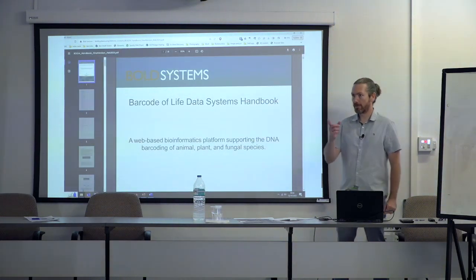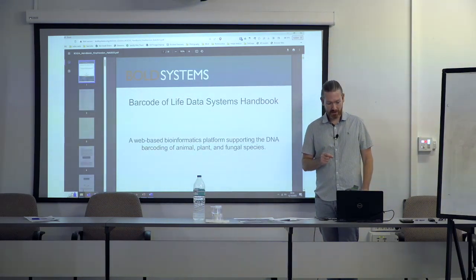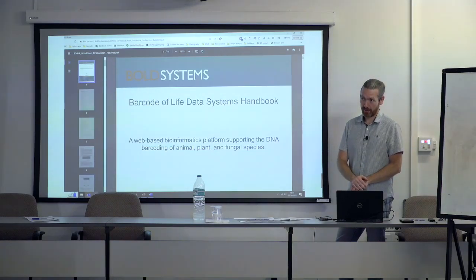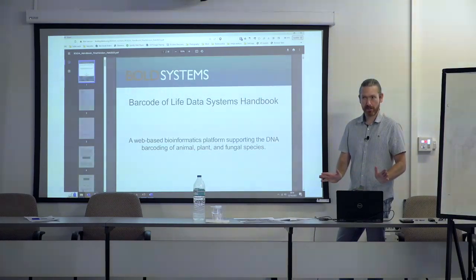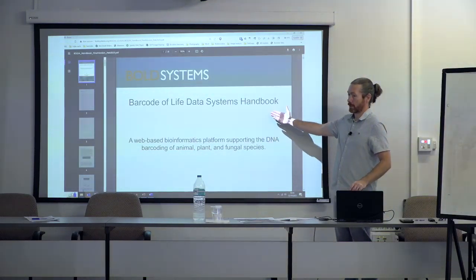There are various videos that the BOLD team have made that are really good and much better than me, but they go into much greater depth. So I'm not going to show those videos. I think we'll just provide them as part of the handbook and things like that. They also have a really good handbook themselves.